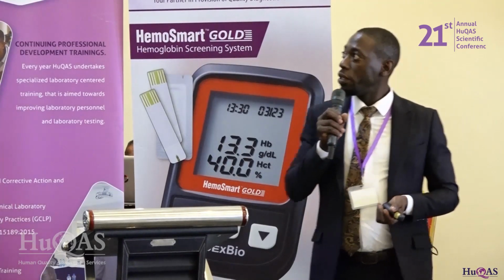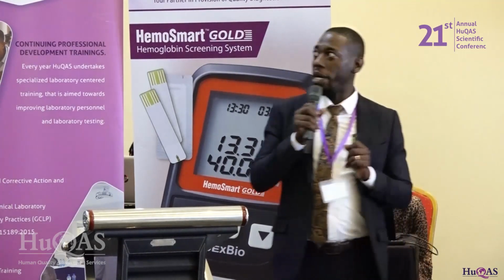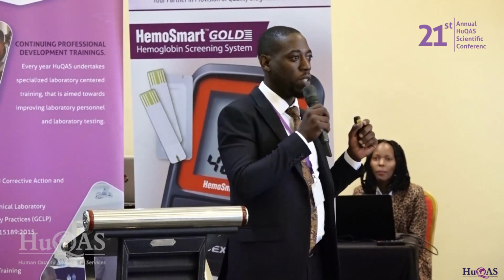In conclusion, there's some level of implementation of QMS in biobanking at NTRL, and it has proved to be relevant. I can tell you, even from the audience, we see the relevance of us keeping samples, but also implementing QMS. So the future plan is for NTRL to include the implementation of ISO 9000, but also there is a particular requirement for biobanking, which is ISO TC 276.